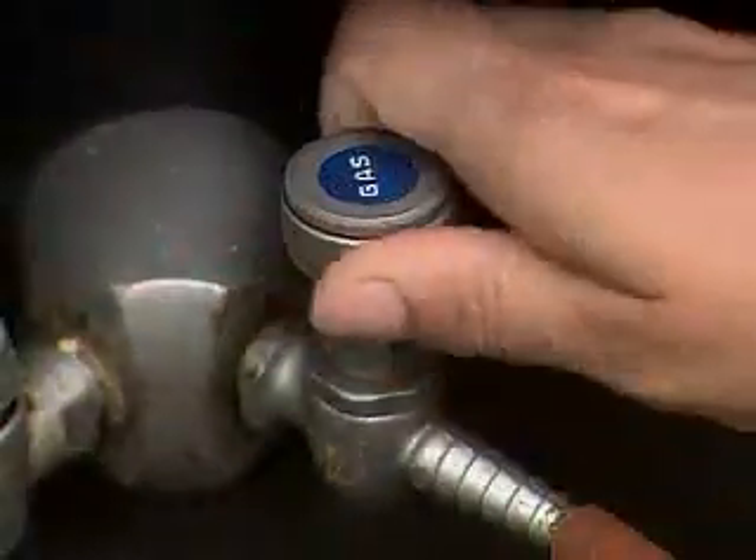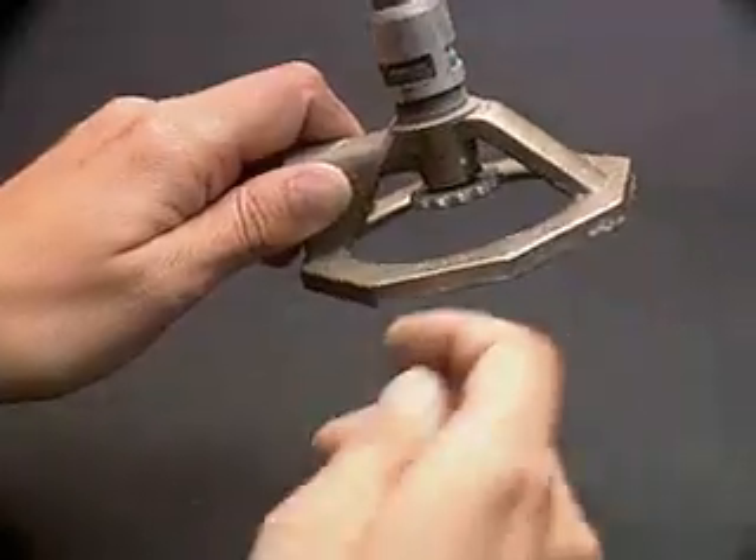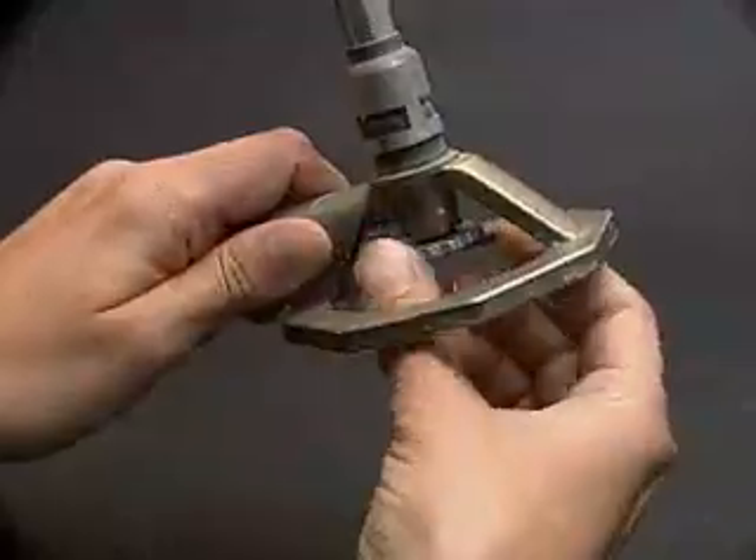Turn on the gas at its source. Open the needle valve to supply gas to the burner.